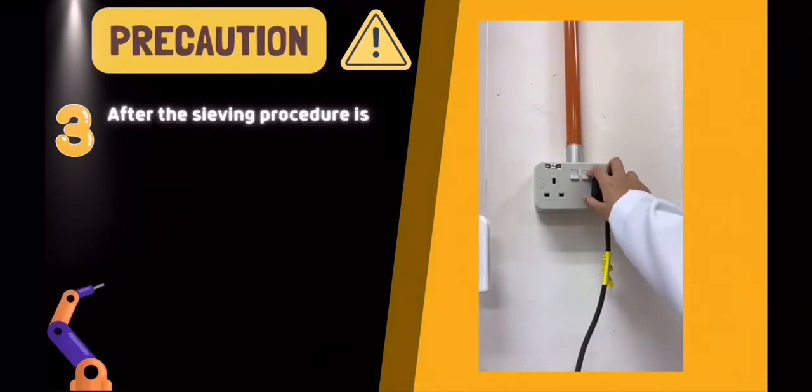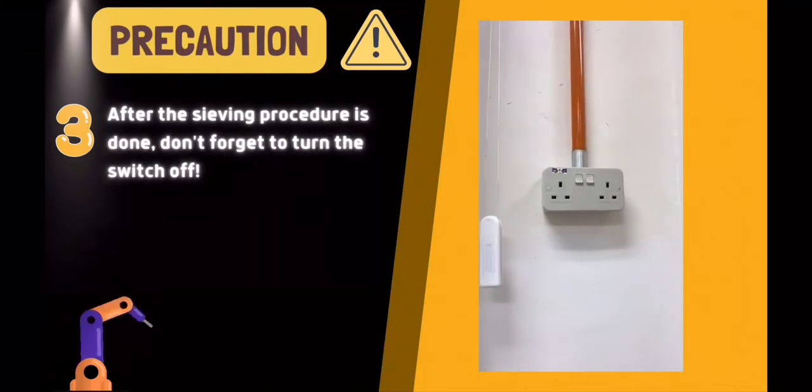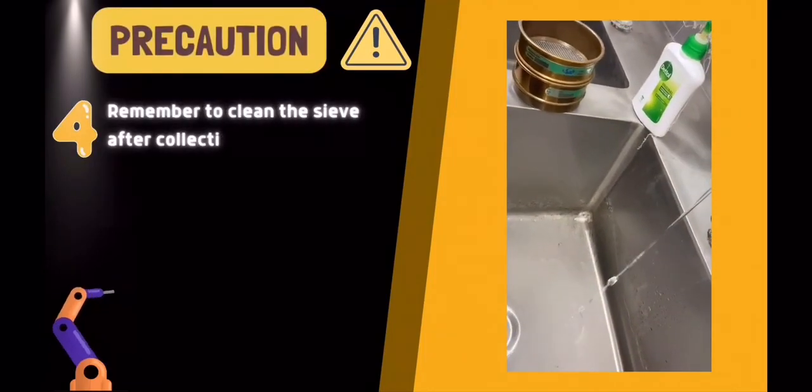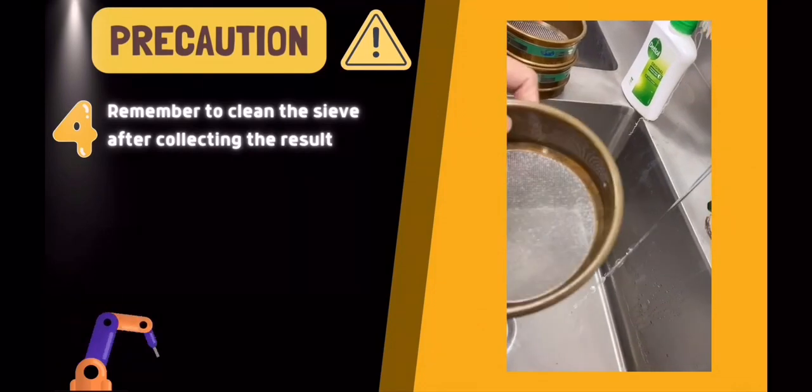Third, after the sieving procedure is done, don't forget to turn the switch off to avoid wastage of electricity. Lastly, remember to clean the sieve after collecting the result to avoid contamination and error for the next use.